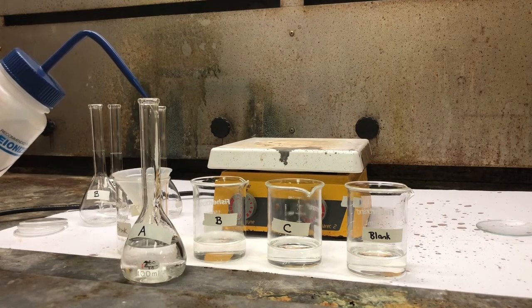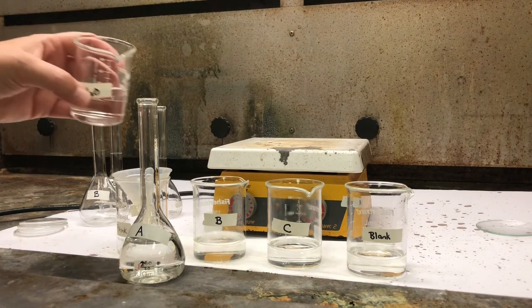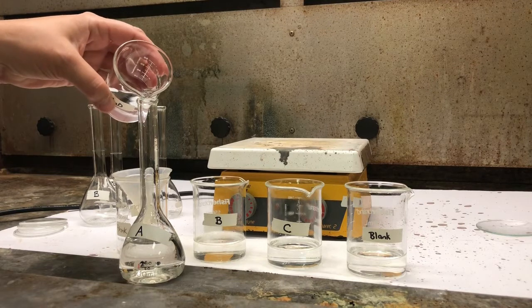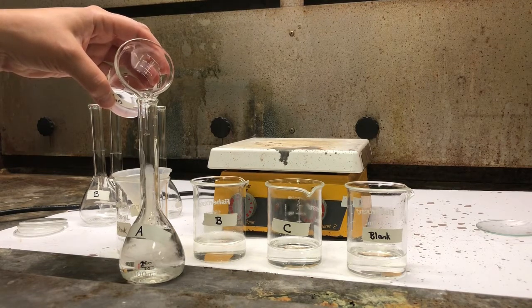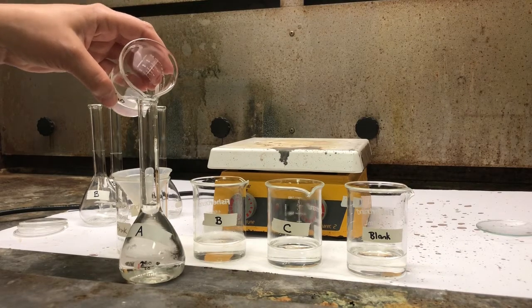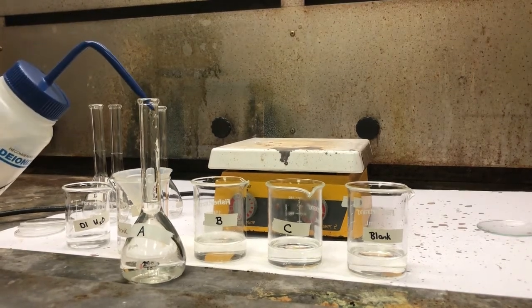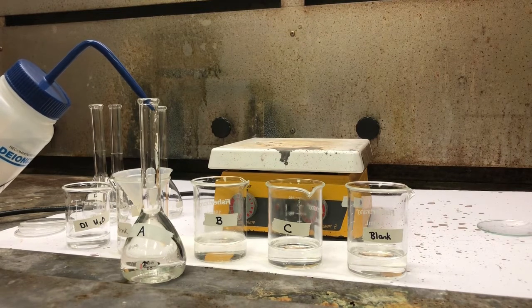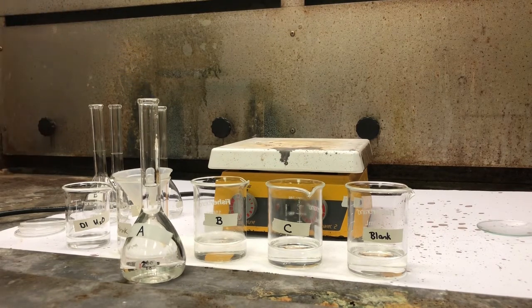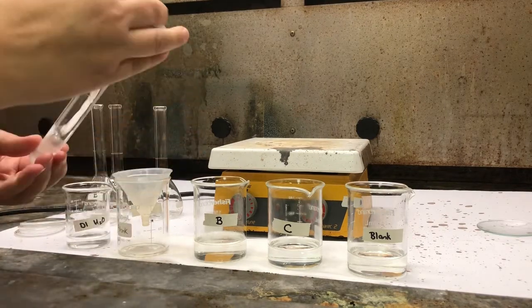Now we're just going to fill it up until we get to the line. I can use a beaker to add water until I get fairly close to the line, but then I need to slow down and use the spray bottle so that I don't go over. Because if we go over the line, then we have to start all over again. We certainly don't want to do that. So now I'm going to seal it with some parafilm and mix it.